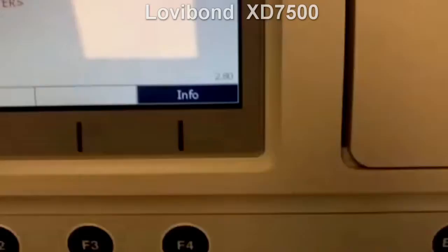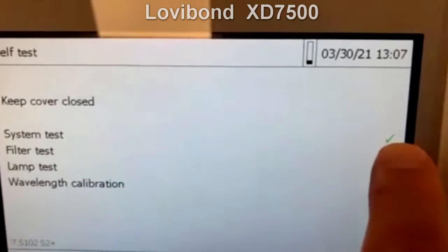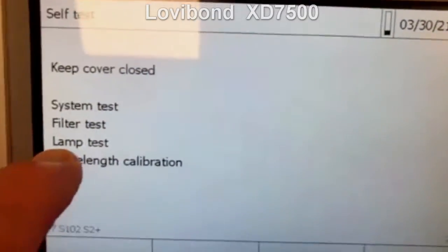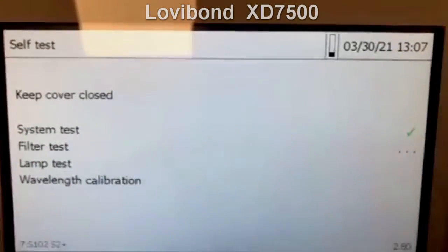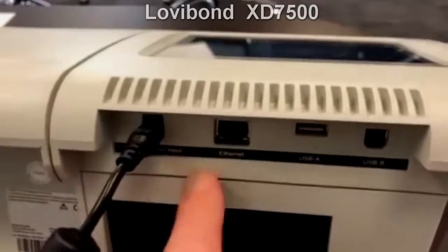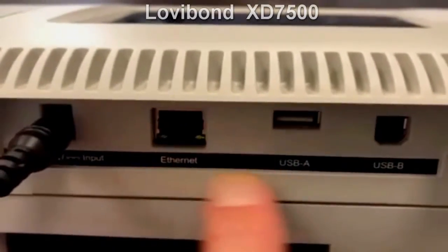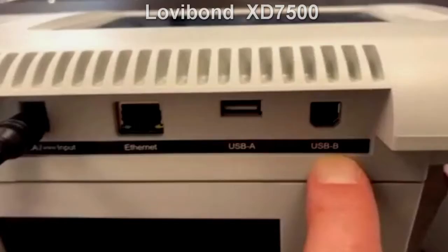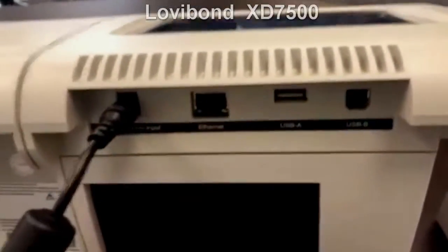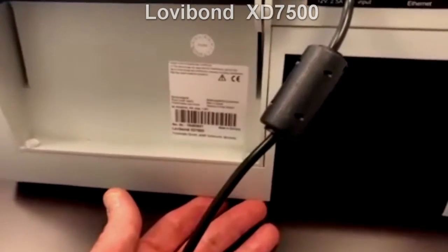Press start to enter the self-test. Now it's going through the self-test — it already completed the system test and is now moving on to the filter test, lamp test, and wavelength calibration. That takes a minute. Looking at the connectors on the instrument, you'll see the power connector, an ethernet connection, and USB-A and USB-B connections — those are the only four external connections to the instrument. And where my fingers are at the bottom is where you put the batteries in for the backup battery to make sure you don't lose any data.